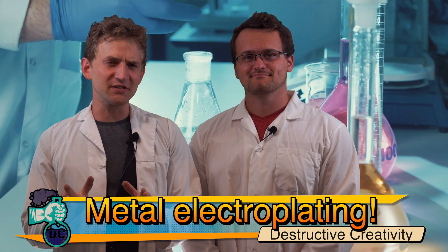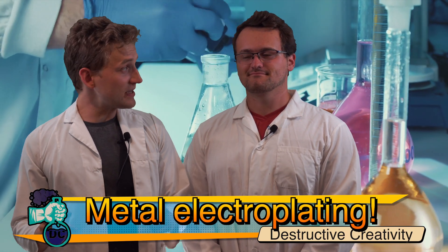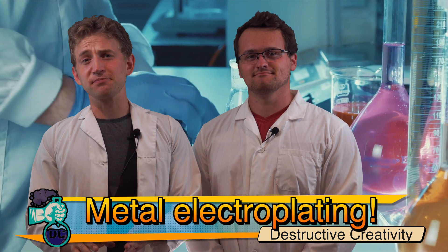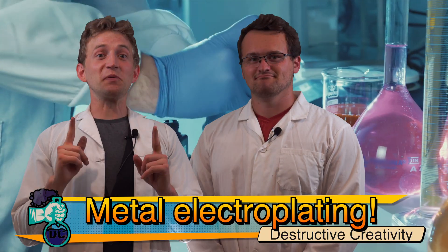Today we are plating metals onto other metals. We're going to be plating some copper onto stainless steel, and then we're going to be electroplating zinc onto some carbon rods. Super cool!